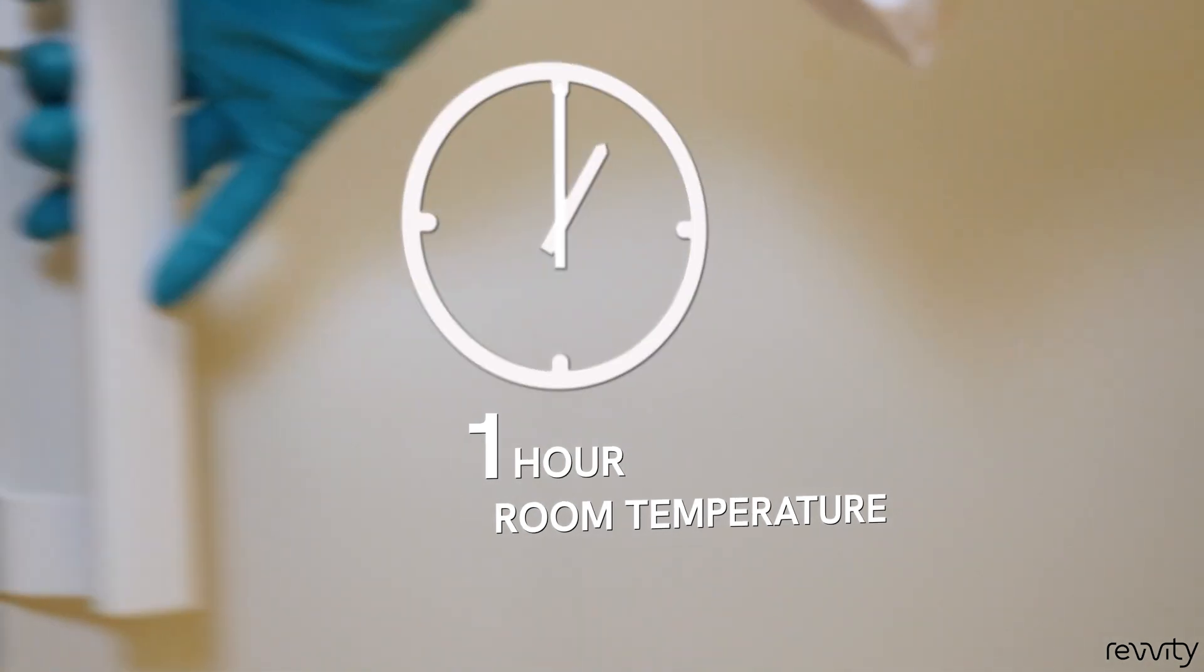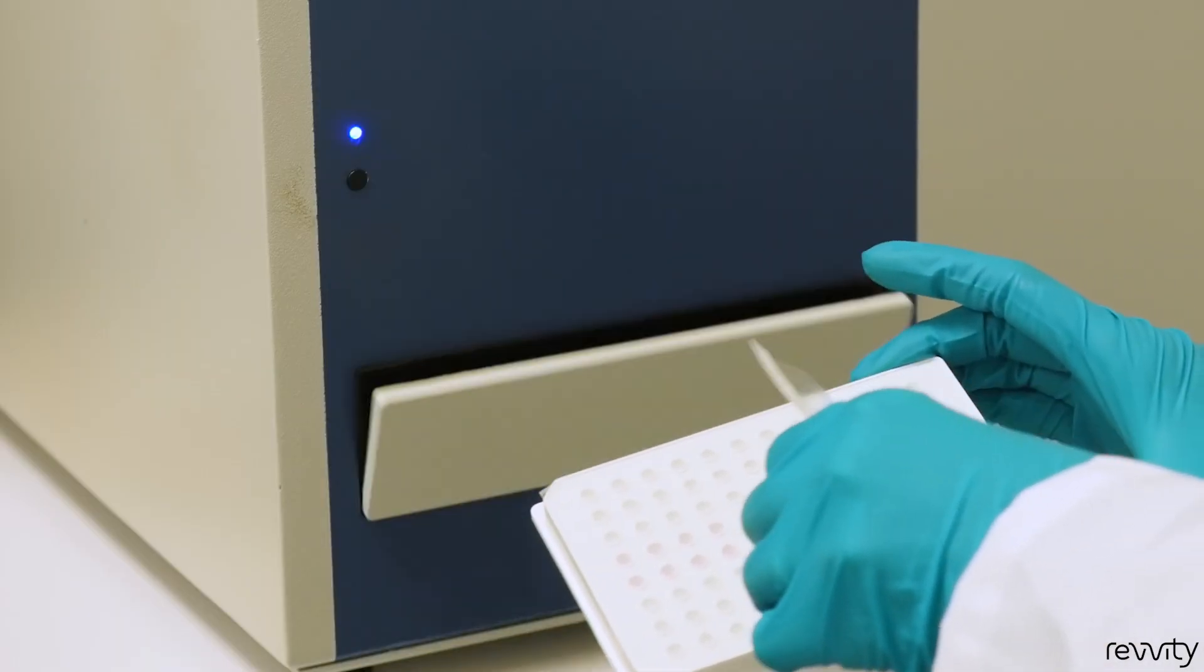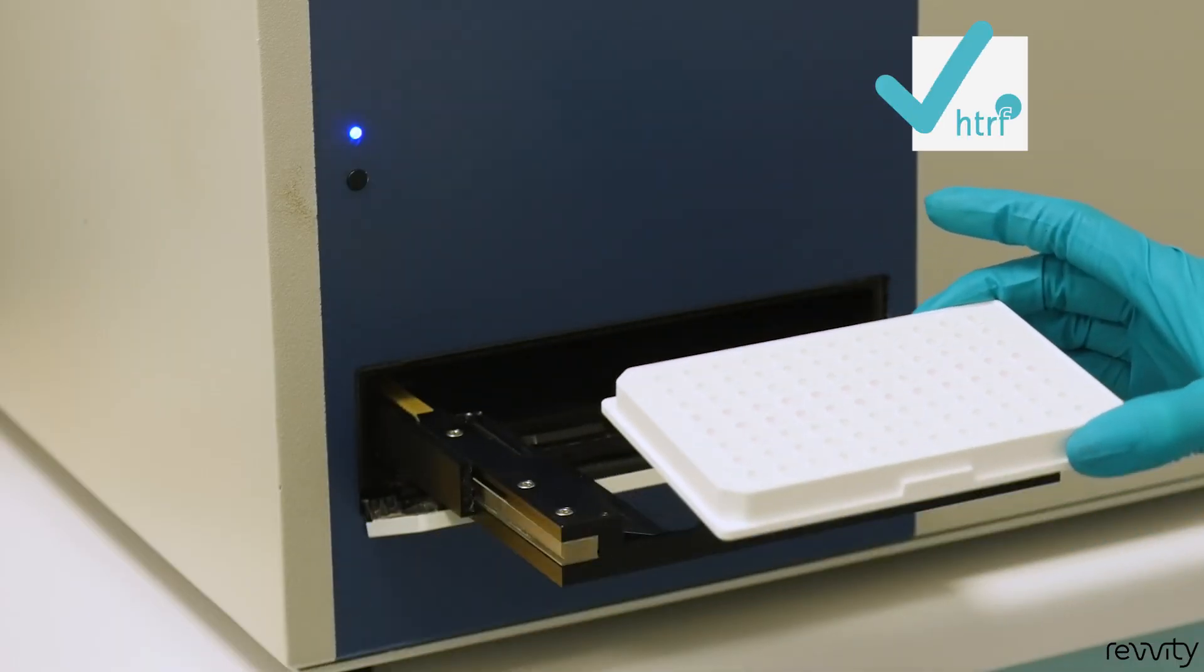With the homogeneous protocol, you can complete your whole experiment in under 2 hours. After incubation, read the plate on an HTRF compatible reader.